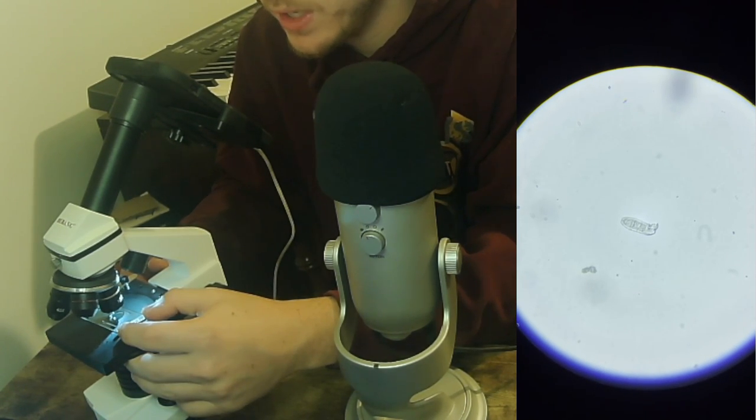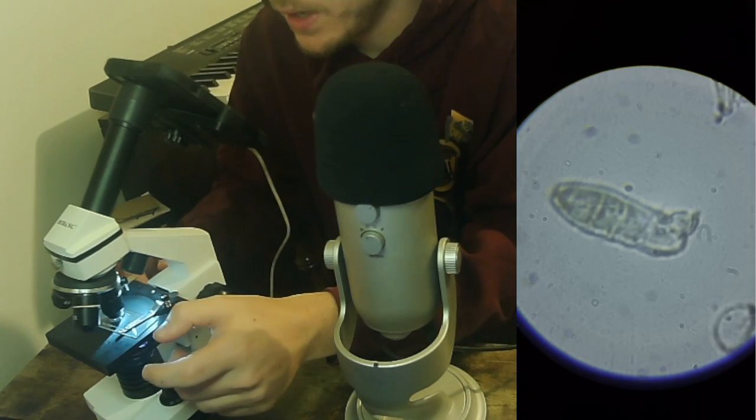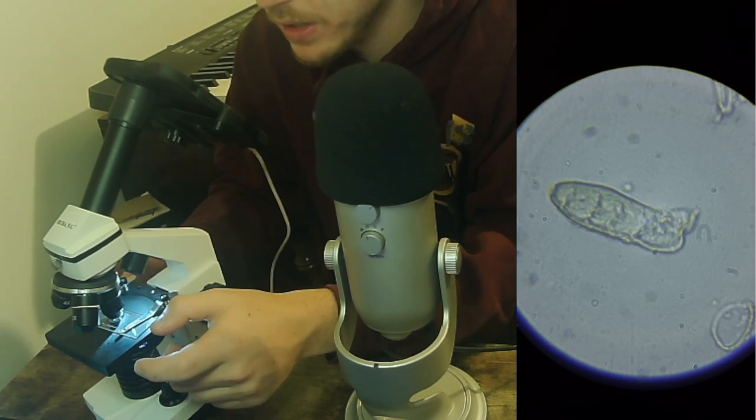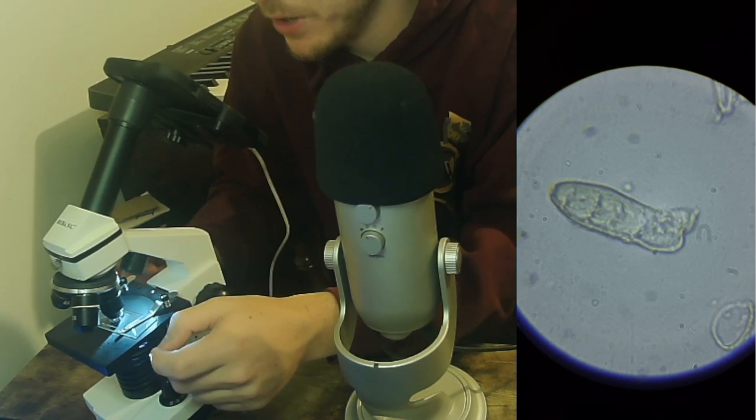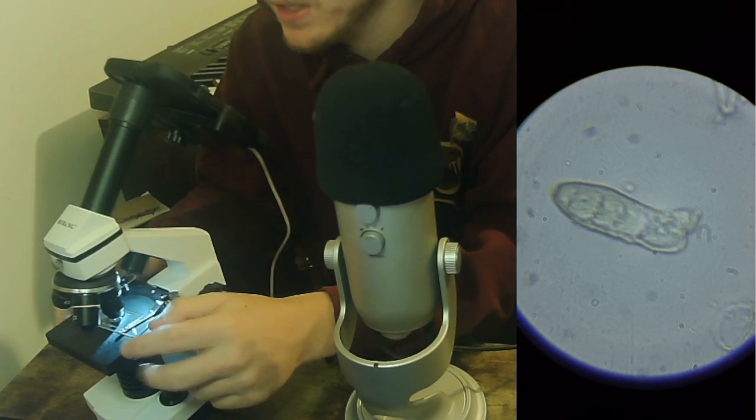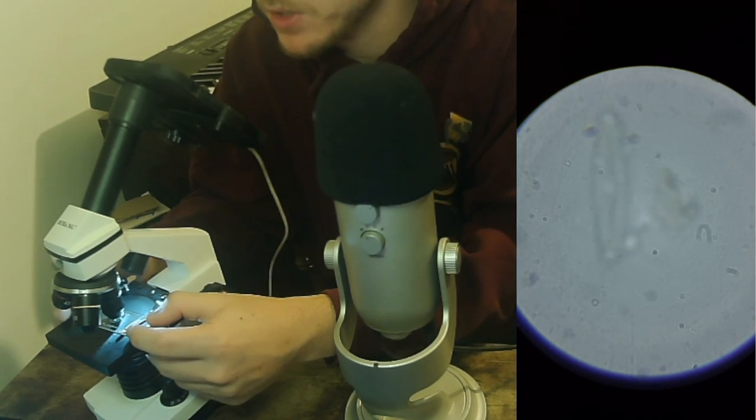All right, this is him at the highest magnification. I can definitely see some movement in and around him, but I'm not exactly sure what he is. I will obviously go identify everything later. I'm not the best with microscopic stuff, but it is cool to look at what's here.